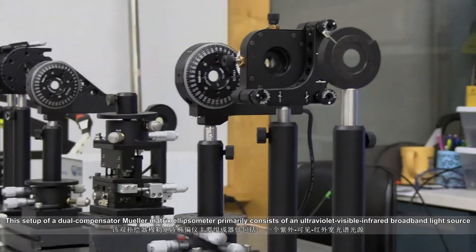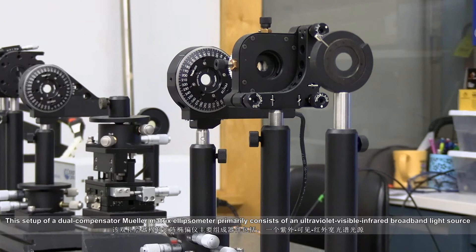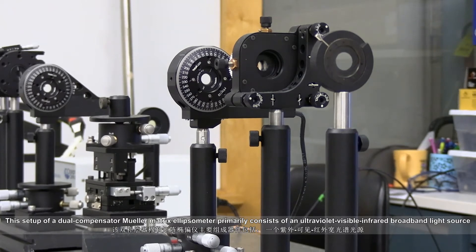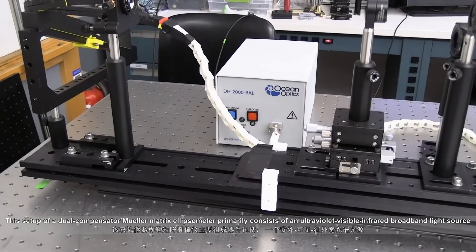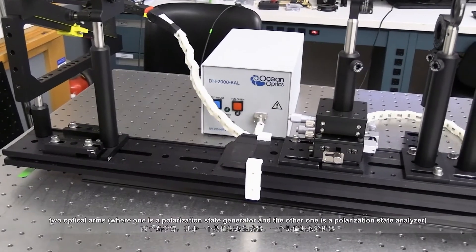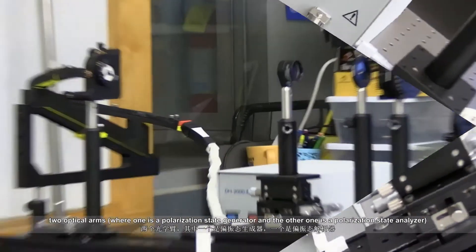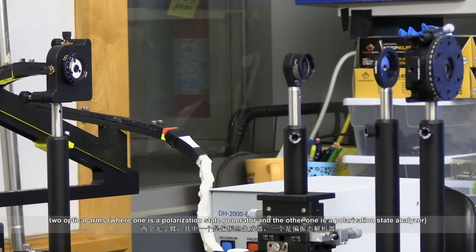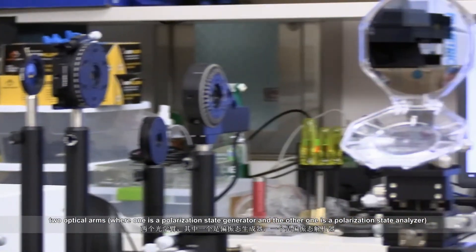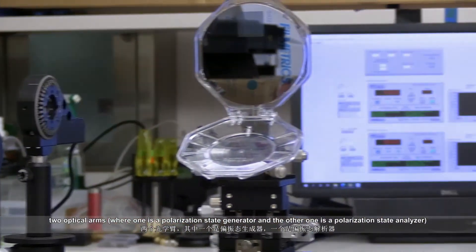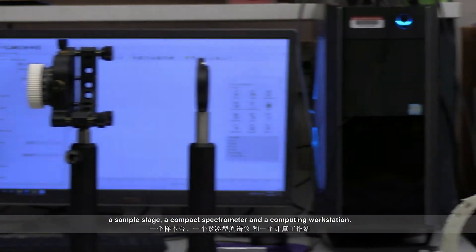This setup of a dual compensator Mueller matrix ellipsometer primarily consists of an ultraviolet visible infrared broadband light source, two optical arms, where one is a polarization state generator and the other one is a polarization state analyzer.